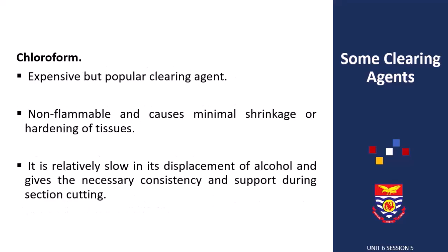Chloroform is also another clearing agent employed in histological studies, and it is an expensive but popular clearing agent. Chloroform is non-flammable and causes minimal shrinkage or hardening of tissues. It is relatively slow in its displacement of alcohol, and it gives the necessary consistency and support when carrying out the sectioning step.